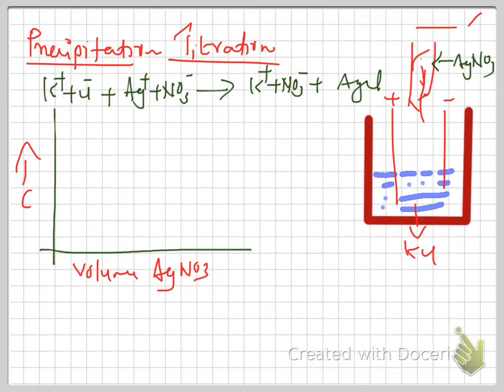During a precipitation titration, when a precipitate is formed, the color change of the indicator cannot be observed accurately. So the detection of the endpoint is difficult under precipitating conditions. Under a precipitation reaction, it is better to measure conductance instead of using any indicator.